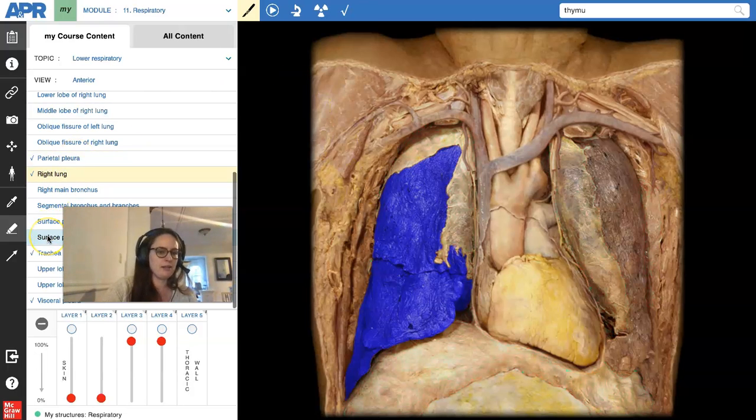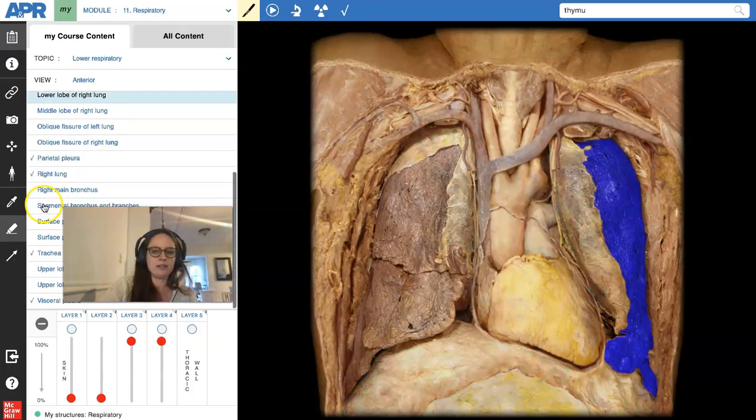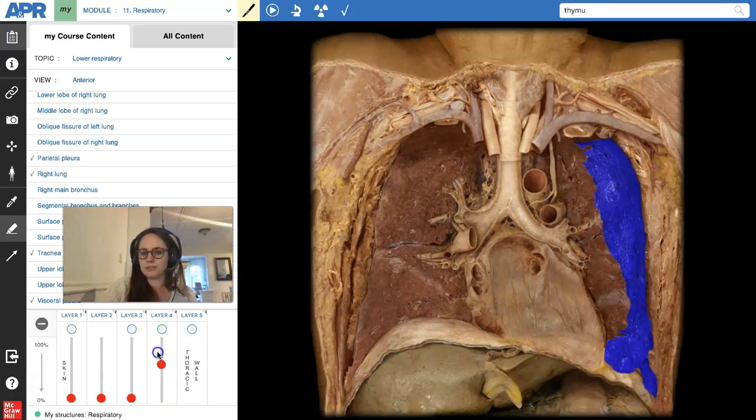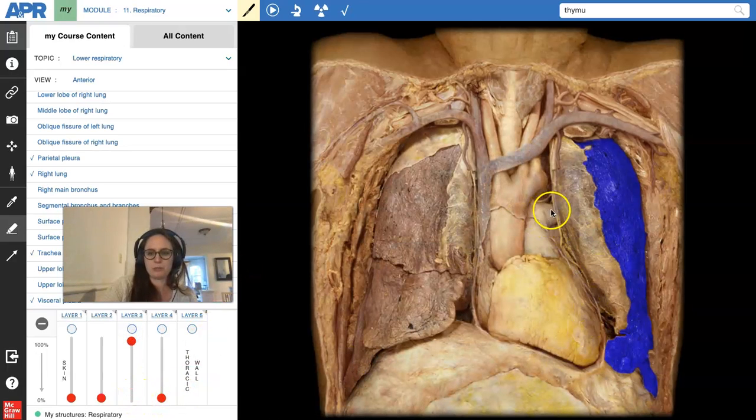So right lung and left lung, and we really have to get rid of that heart if we want to see the trachea, which is what we're looking at right now. Okay, here's trachea and here's inside of the trachea. So you have your blood vessels cut away. You had, remember, from your heart, the pulmonary vessels, pulmonary trunk, pulmonary arteries, pulmonary veins.